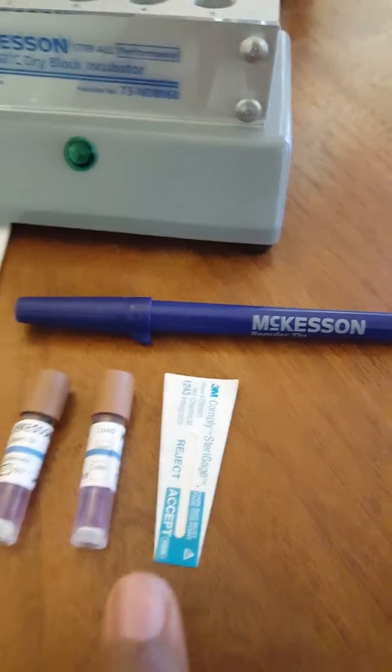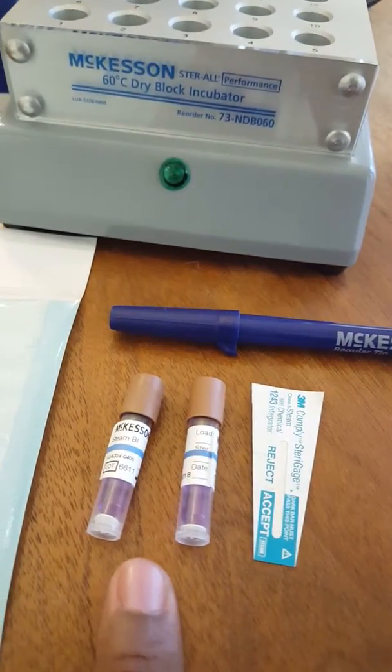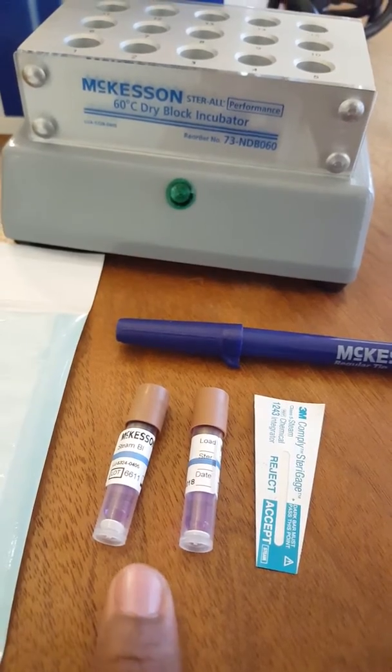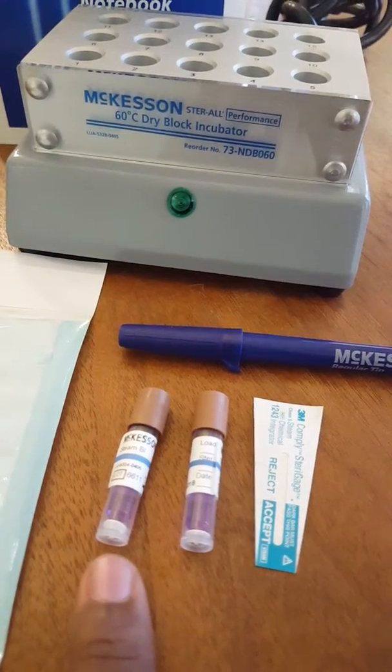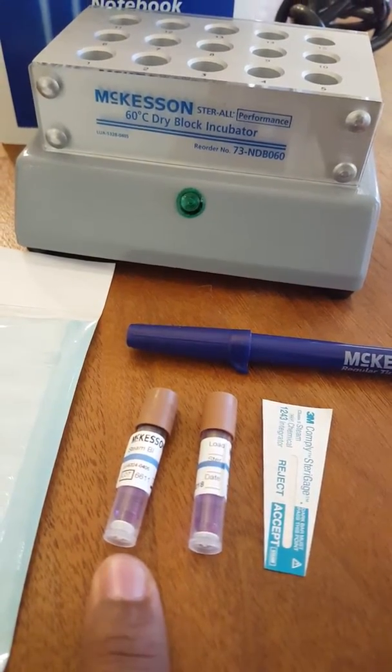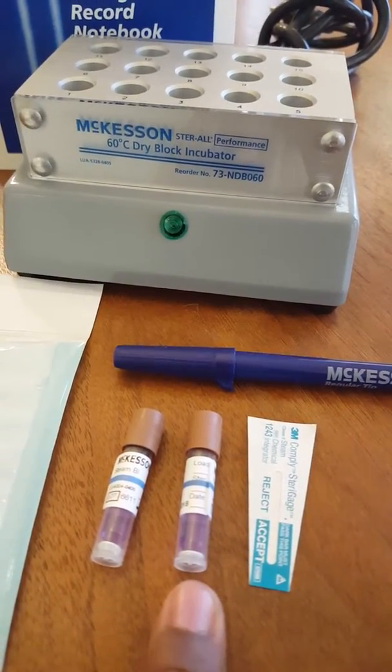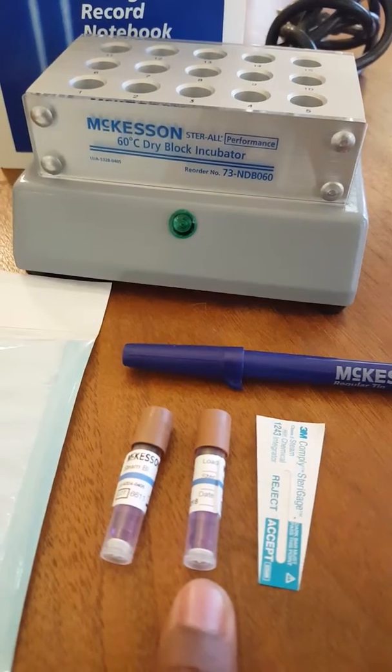darker in color. Now on the BI indicator, which is a biological indicator, the way that we're going to use this is we're going to have 2 of them. One's going to be for the test that we're going to be doing within the autoclave. The other is going to be a control to confirm the presence of spores.